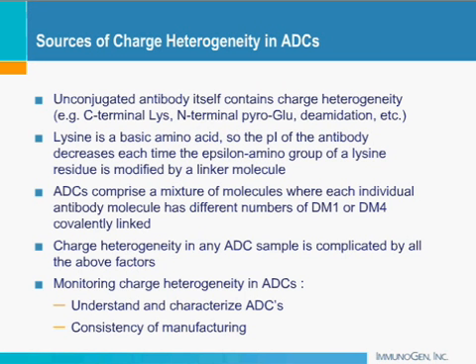But when we added some urea to the sample, it helped keep the sample soluble while it was being focused. And you see a very nice and clear separation of charge-based species, and the resolution is fantastic. So addition of some of these additives might be necessary depending on the nature of your analyte molecule.